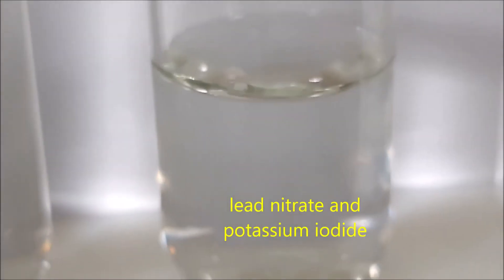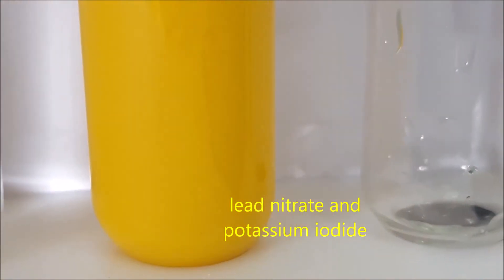For test tube number eleven, we have lead nitrate and potassium iodide.